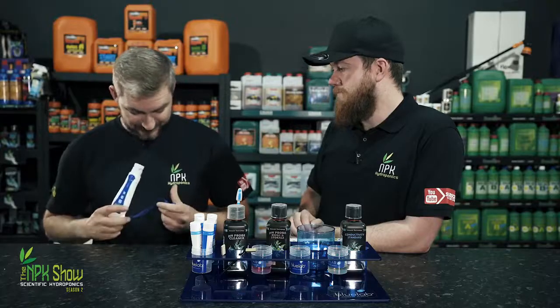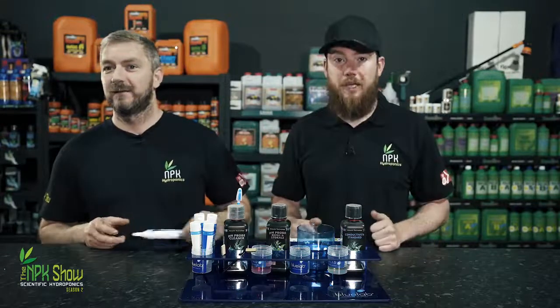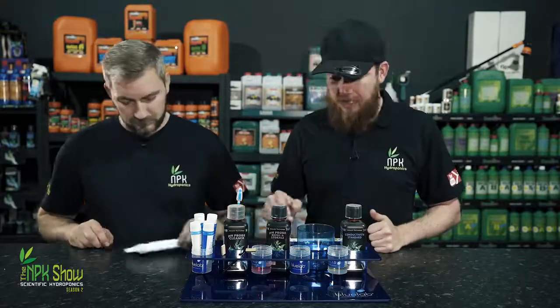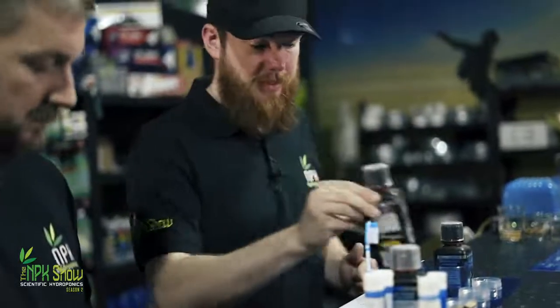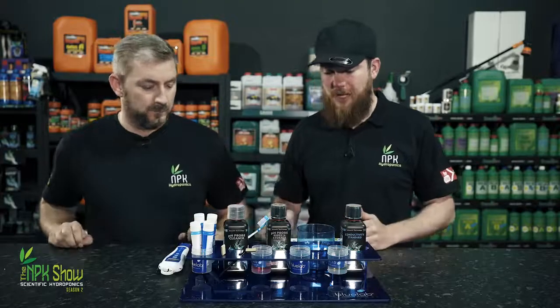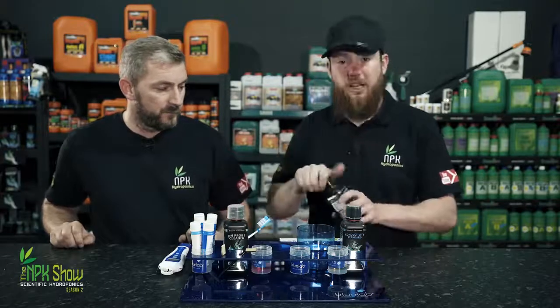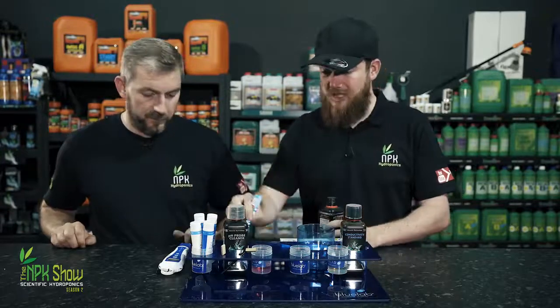It's dry. If it dries, what happens? Dies. It dies. So don't let your pH probe dry. Always keep it in some pH probe refill and storage. That's my top tip. Before we get into calibrating, if there are any issues with your pH pen, fill up a little jar, leave it for 24 hours, and it should sort most issues.